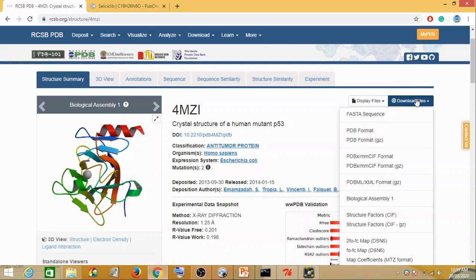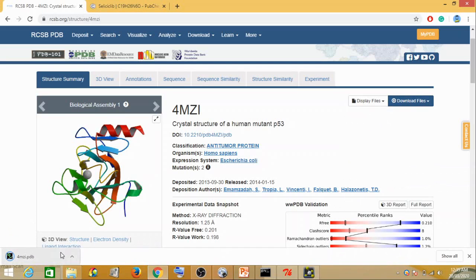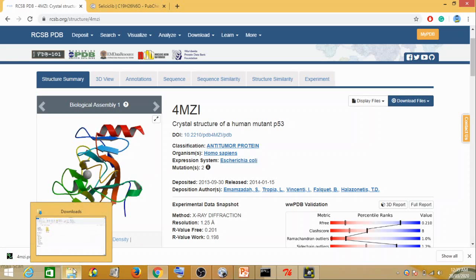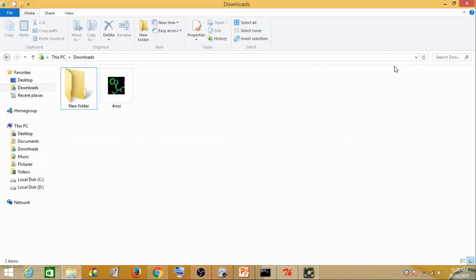I go to download files and click on PDB. You will see it here. Then in the downloads you will see your 4MZI PDB file being downloaded. Now this is your protein.